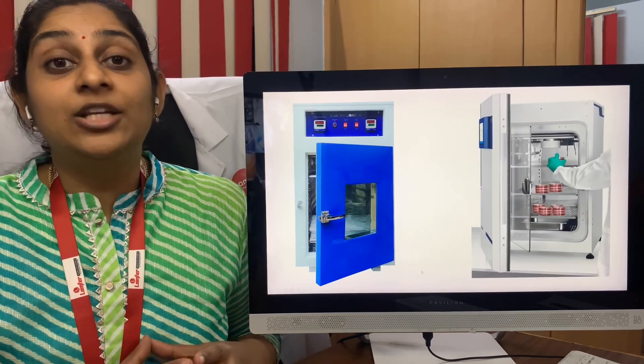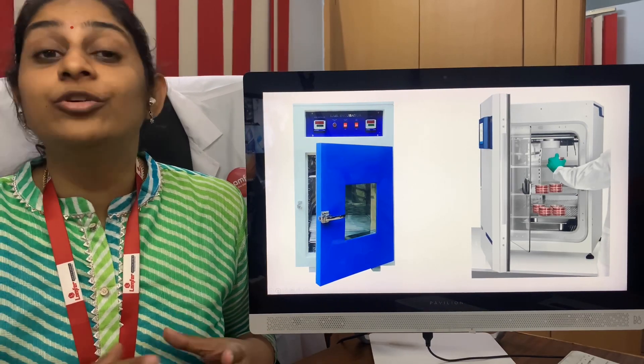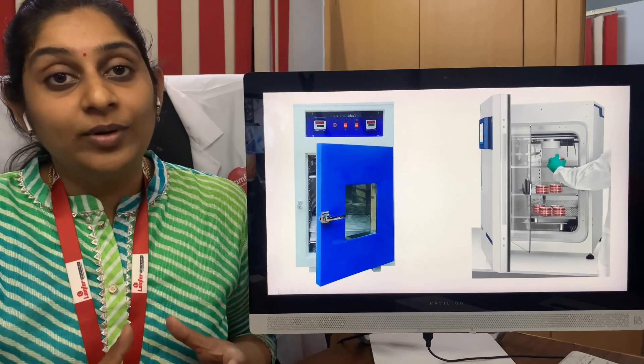The incubator is mainly for microbiological cultures. You have various variants of incubators ranging from 5,000 rupees to even 90,000 or a lakh of rupees. You can purchase the incubator based on the needs of your microbiology specimens.